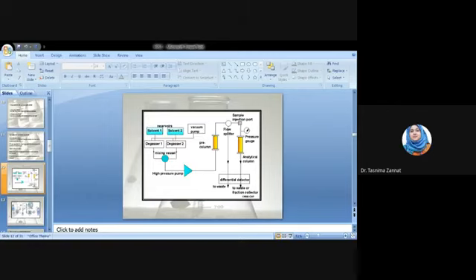The components which have more attraction to the stationary phase will be the late eluter, and the component which has no attraction to the plate will go first. This is the inlet point of the column, and this is the outlet point, meaning the exit point.